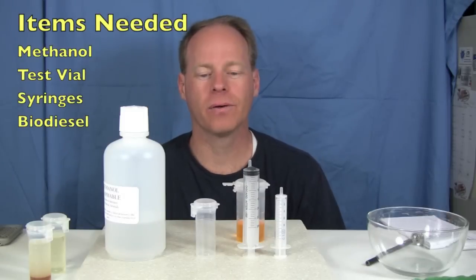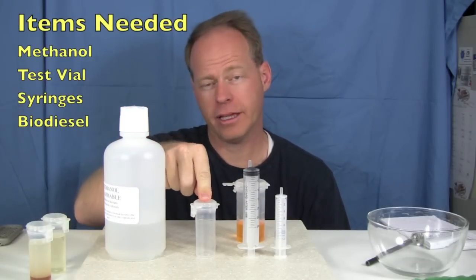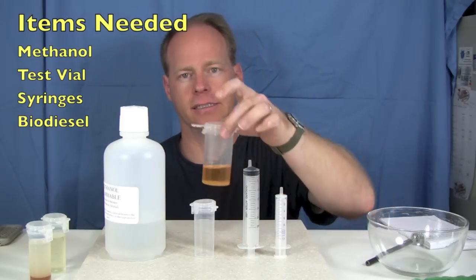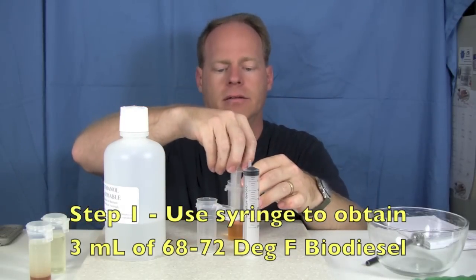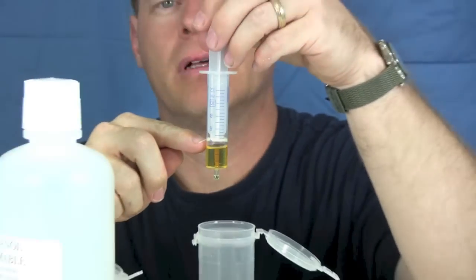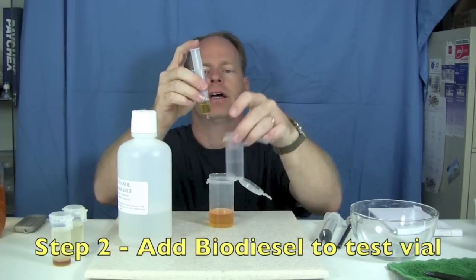To do the test with this kit, we're going to need methanol, a vial that's about 38 milliliters, our 30 milliliter syringe, our 10 milliliter syringe, and some biodiesel that we want to test. Open up your biodiesel to be tested and suck out three milliliters of the biodiesel. We've measured out three milliliters and we're going to put this into our little vial.